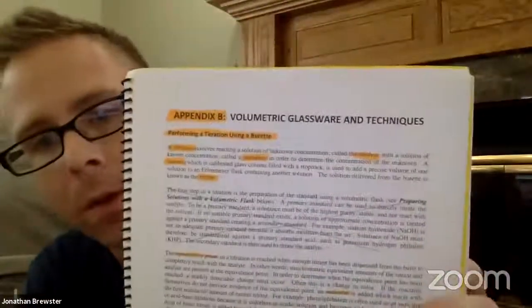So if you've recently taken it, the key things to take away is that we're going to cover the stuff on page 45 for the lab, but also page 83, Appendix B, where it's going to go over some techniques for performing a titration with a burette.